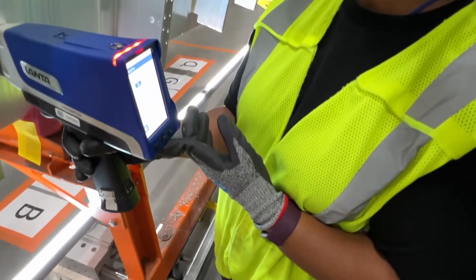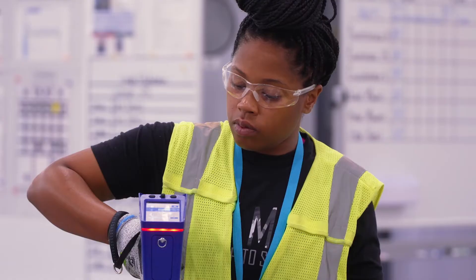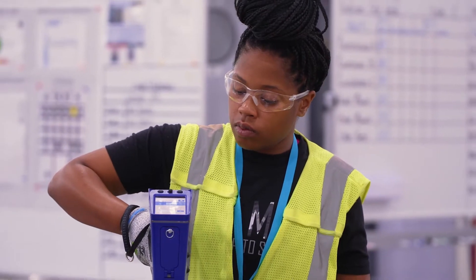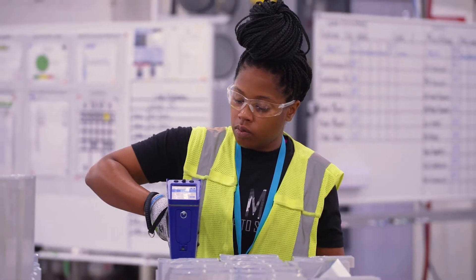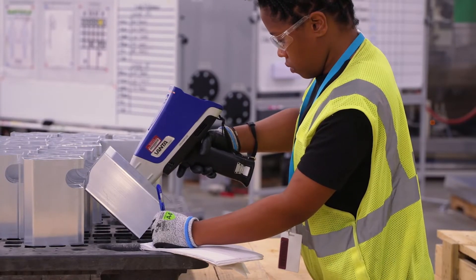The quickest way to explain how to use the XRF gun is: you put the analyzer on the part, you pull the trigger, the machine will give a reading, you record the reading, and you take the reading specified for the part that you're testing.